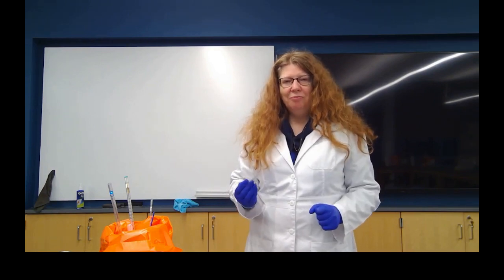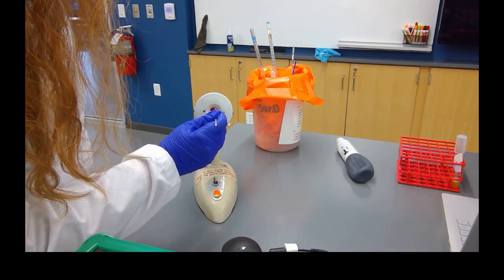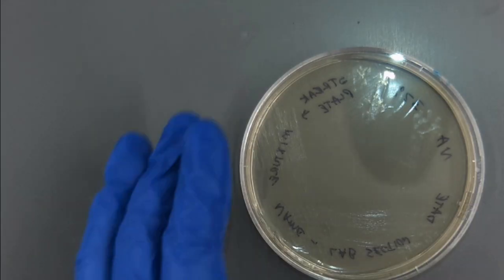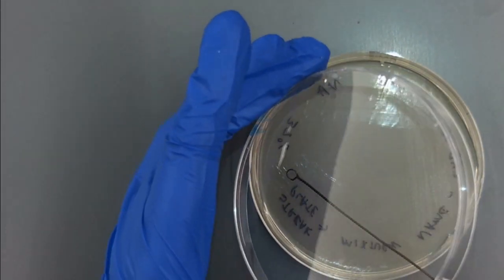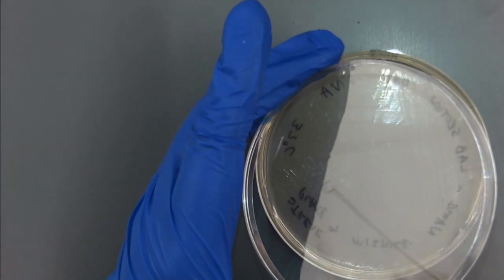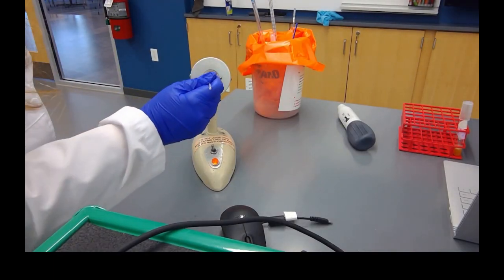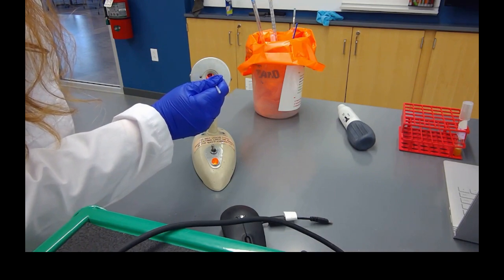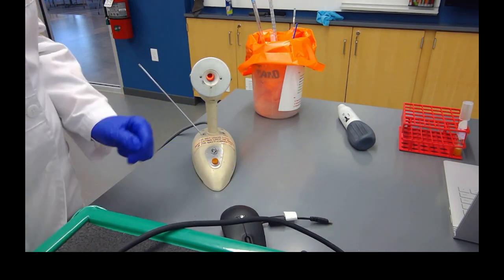I'll flame the loop again, insert until it's red hot, withdraw, and let cool. And now I'll do one final set of streaks into the middle. Using my lid as a shield, I'll take my last set of streaks, drag it into the middle, and do one final flaming of the loop. Final time, insert until red hot, withdraw, and let cool. And I'm going to go and turn off the back of the incinerator.